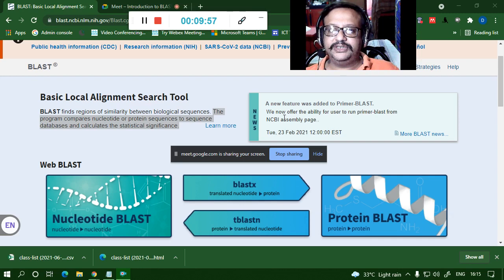But then suddenly you design a primer and you see that nothing is working. You're not getting any match, or you see that 5 or 6 nucleotides are not matching, 5 out of 30 nucleotides, or 6. It's not a good primer. So you redesign your primer properly. Before you spend the money on synthesizing the primer, you check through this blast. You can use Primer-BLAST and see if it is fine or not.